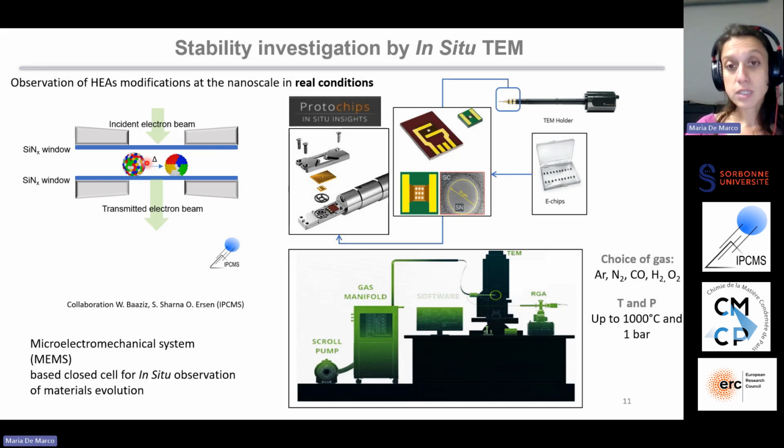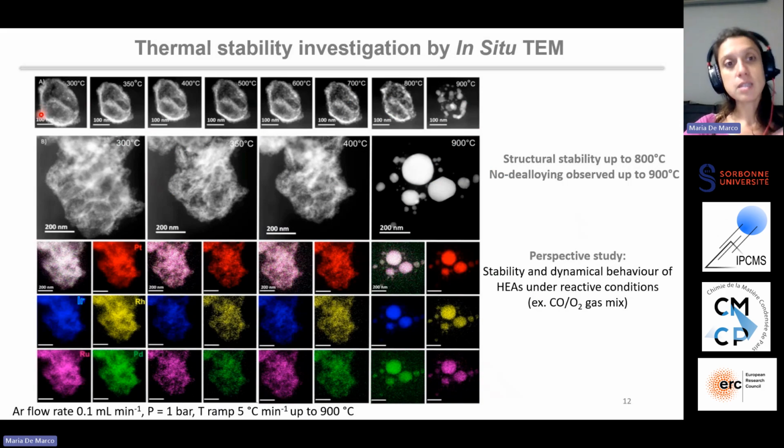These are the results of these studies that you can see in this slide. Basically, here you can observe one single pore from our porous particles. Here you can see the walls of the pore, and you can observe that between 300 and 350 degrees, there is a significant shrinkage in the volume of the pore, which is actually due to the reduction of metals from metal chloride, so metals with oxidation state 3 or 4, to pure metals.